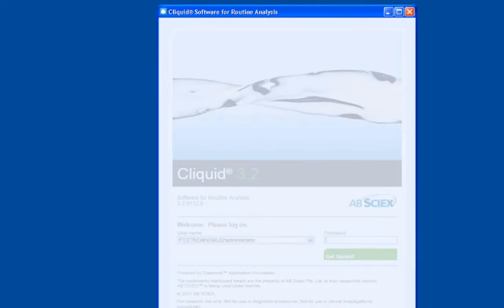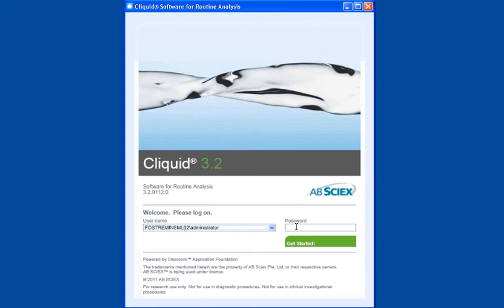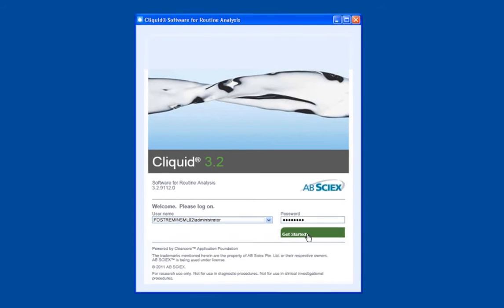Qlikwid is a password-protected software package. User accounts and access are set up by an administrator with an analyst. Once the user has a unique login ID and password, they can enter it and get started in Qlikwid.